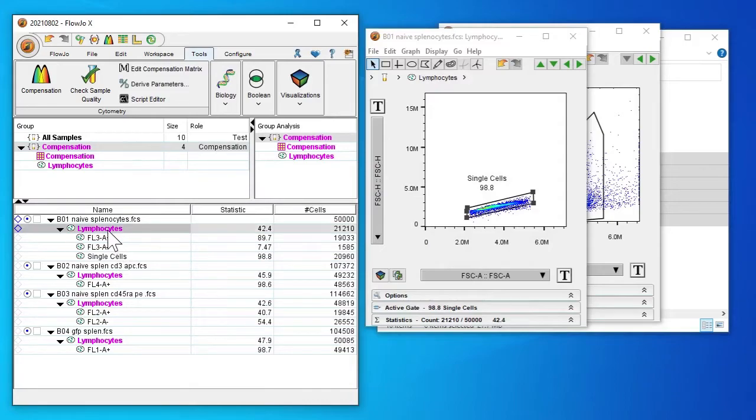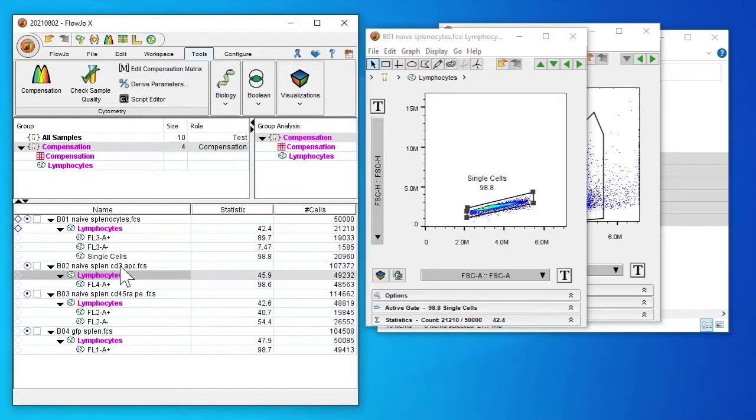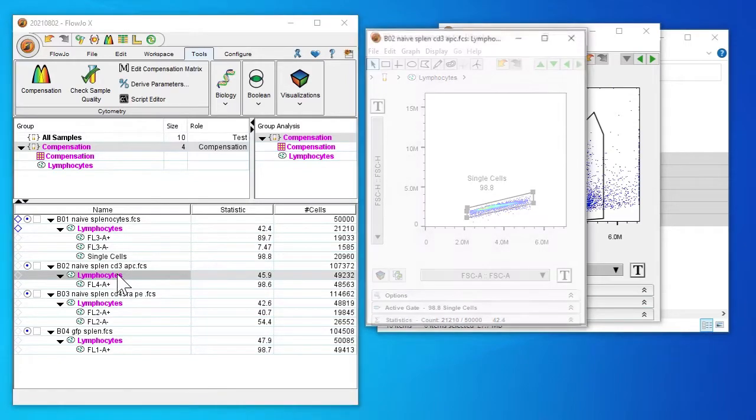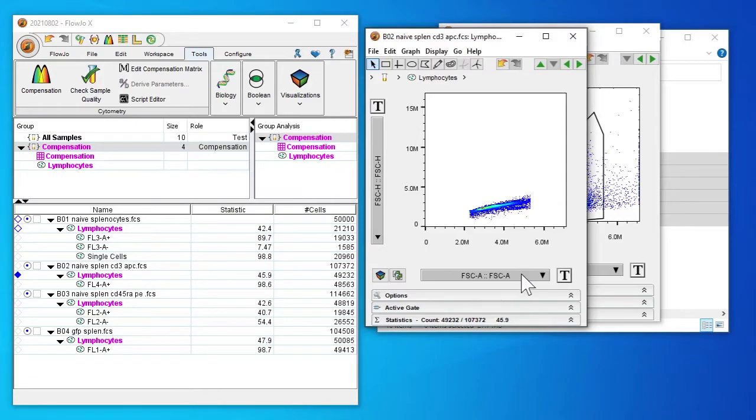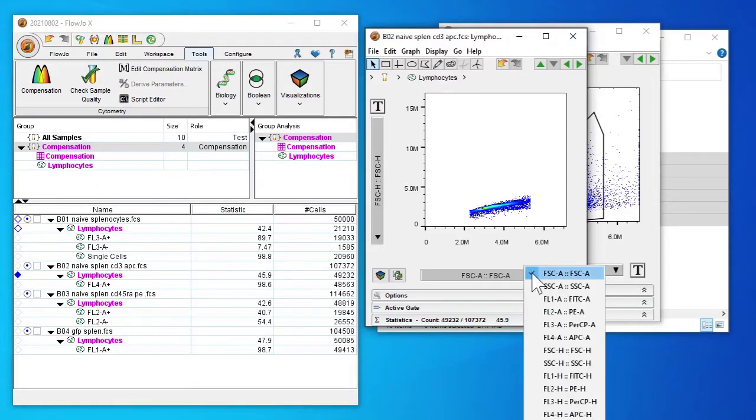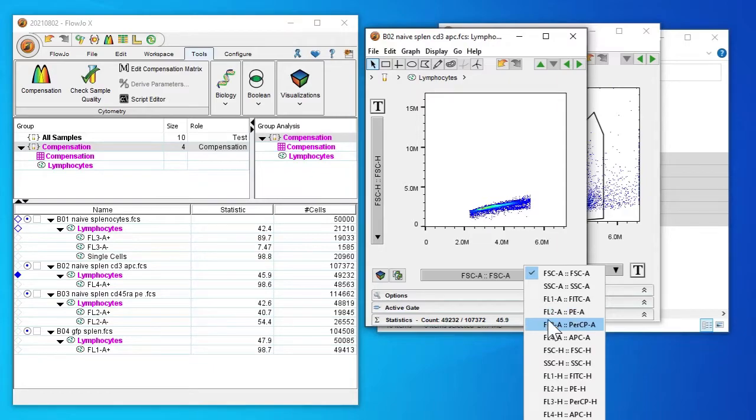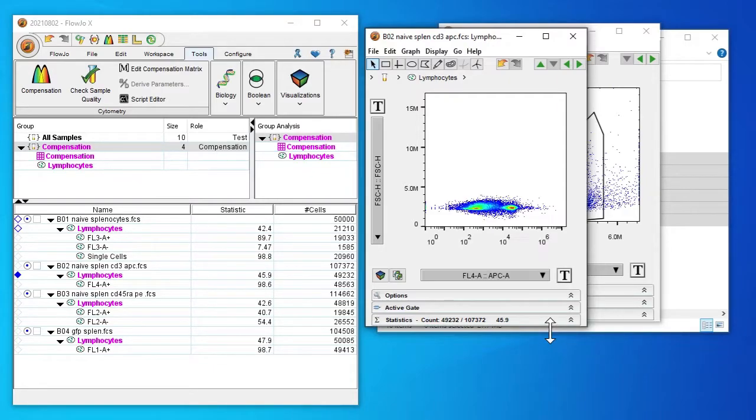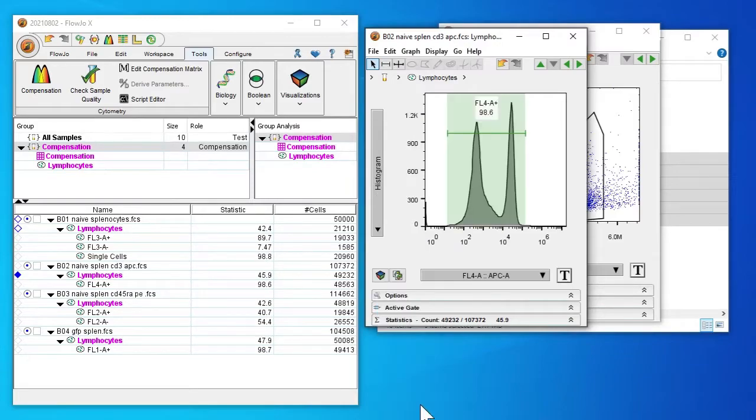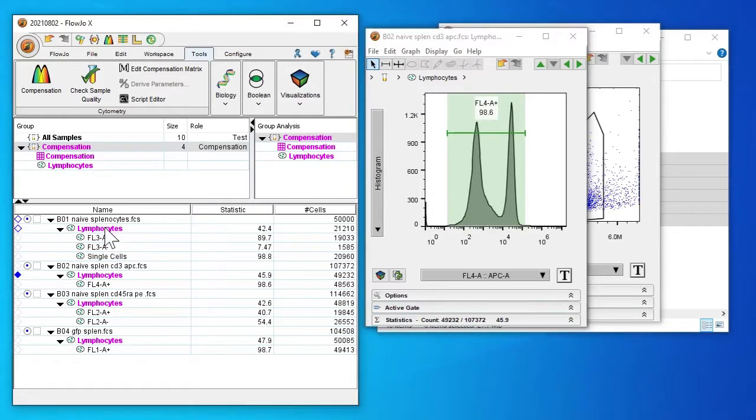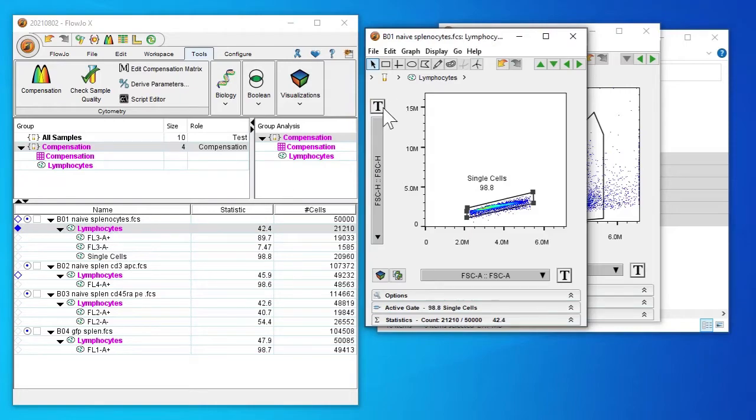We're going to double click on this C3APC. I'll change it to the APC signal as seen by FL4A. And we see that only the positive is being automatically set by the computer.